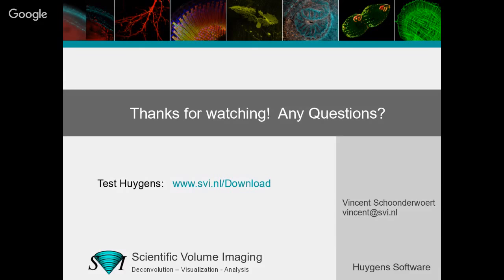Then the second question is, which parameters can I further use to optimize my deconvolution result? Well, in the last step of the deconvolution wizard, you can increase the amount of iterations, and you can decrease the quality threshold, which is the difference between two subsequent rounds of iterations. If you do that, you continue with deconvolution and you have a chance that you will further improve the result.